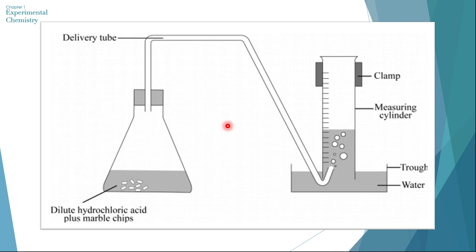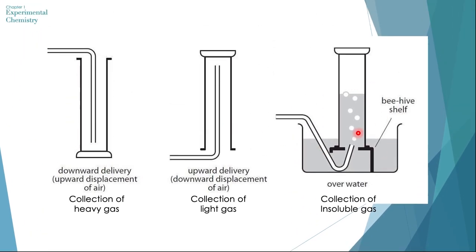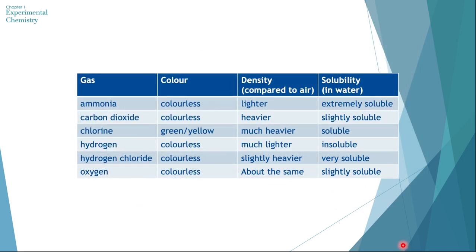The upward delivery and the downward delivery, and the collection of insoluble gas over water. I hope you've understood this. Also, I hope you're going to memorize this entire table of gases and their properties.